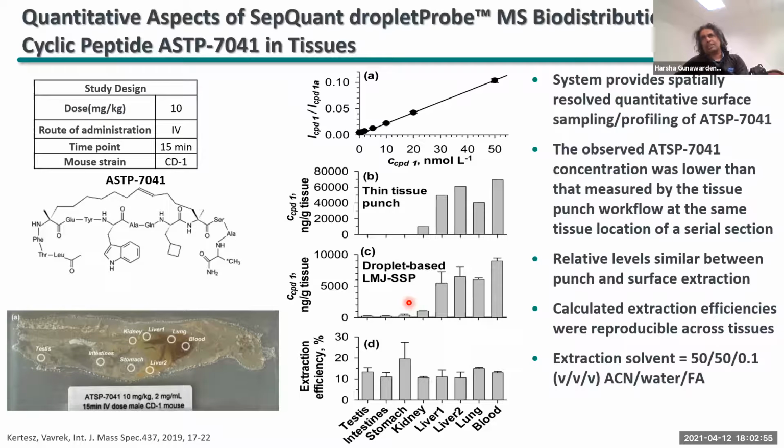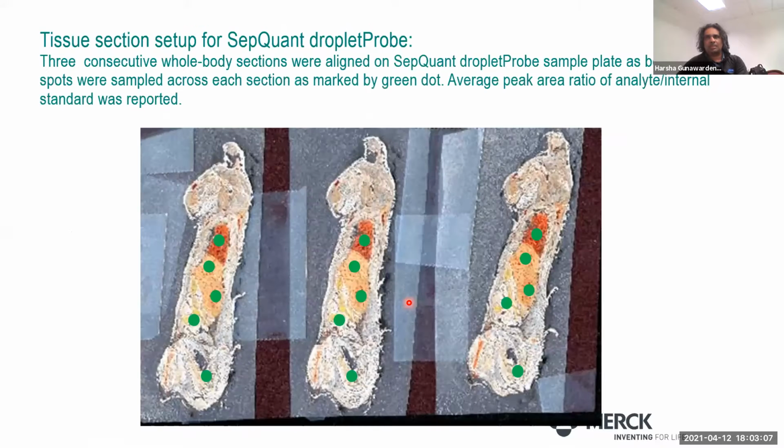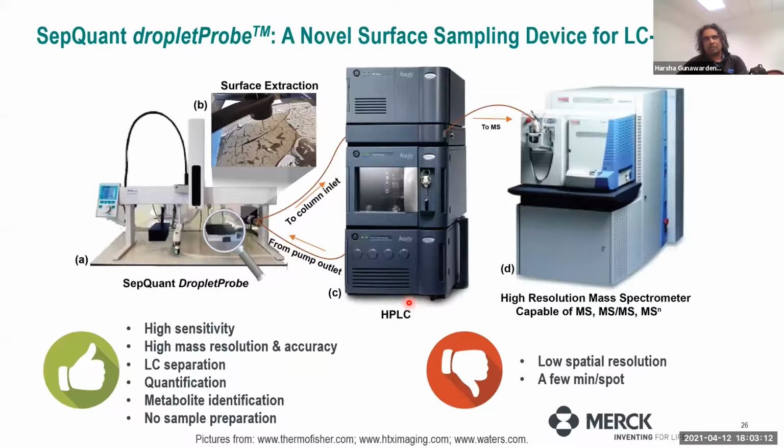Yeah, so that's another leading question that I had: what if you can replace the LC without having to go through a column? If you can do something like flow injection, without having any separations, what would you expect? Would that be compatible with how you would sample? Is the sampling rate the rate limiting step in those instances? I just want to know, if you were to replace the LC and have it directly infused, is there some limitation there? Yeah, there are limitations.